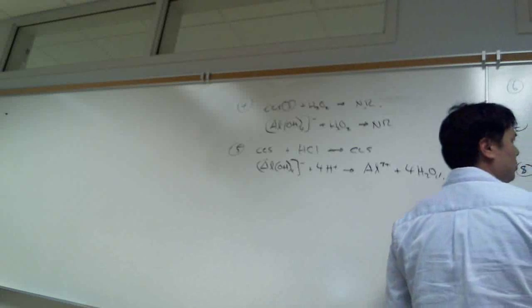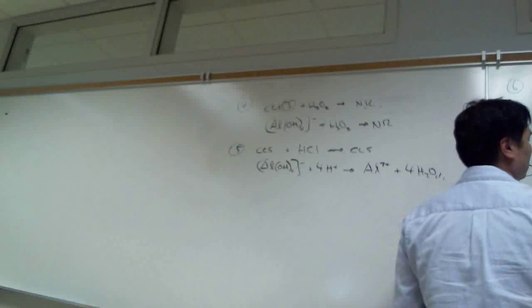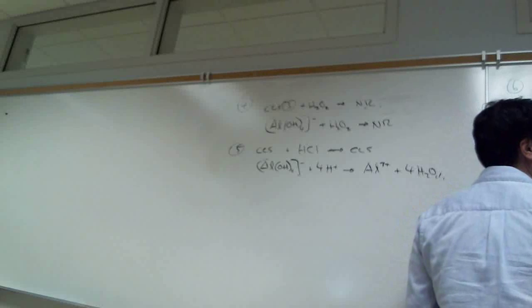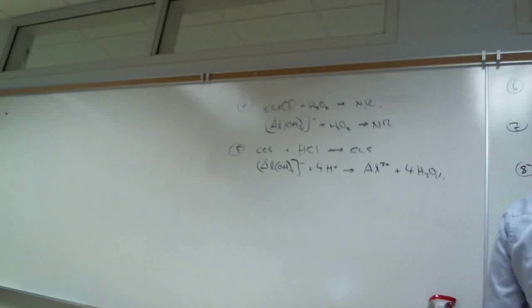And the red PPT, what is it made out of? The red PPT is just made out of aluminum hydroxide that's been colored with aluminon. Aluminon gets incorporated as an impurity. So there's not much aluminon in there. And so what we do is we represent that as an impurity by maybe putting it like a double dagger like this next to the aluminum hydroxide to indicate that it's not pure. And then 3 ammoniums.